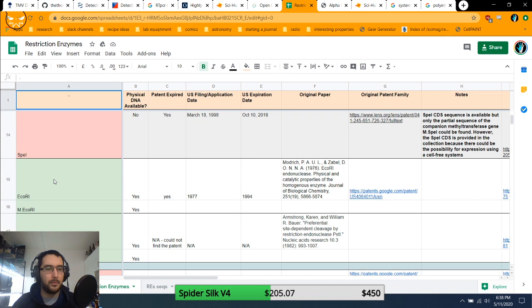What's really cool is you can use that raw extract of bacteria as a way to handle DNA. So if you need to cut some DNA, you can actually just use that raw bacteria extract, and it'll work as if you'd had the pure stuff from NEB. Now, this is obviously going to chew up your DNA a little bit in places you don't want, but it works.